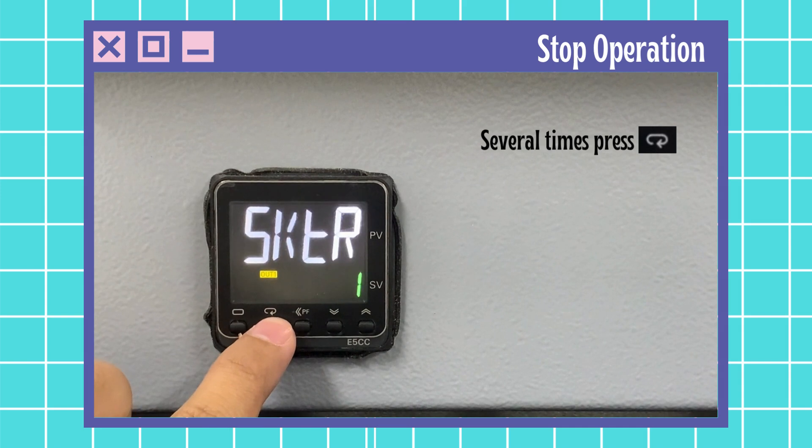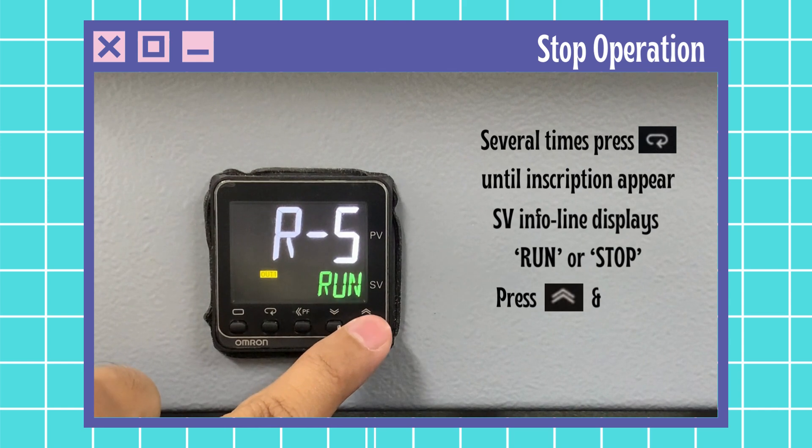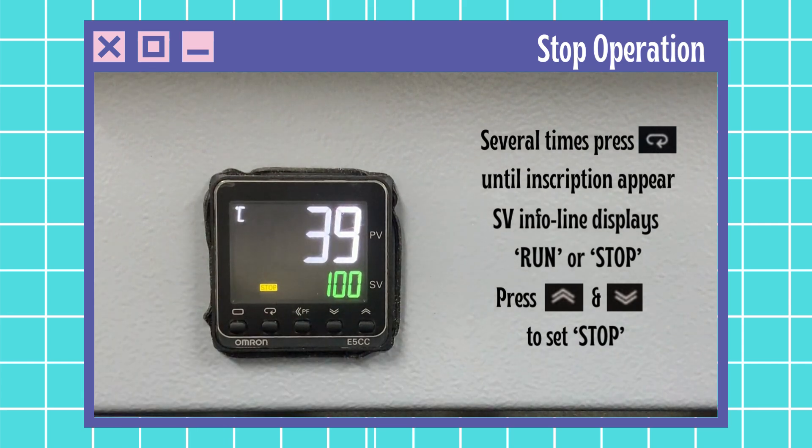Press mode key several times until the inscription RS appears, then press up and down button to set stop. Wait for 2 to 3 seconds for it to set. The furnace will automatically stop the heating operation.